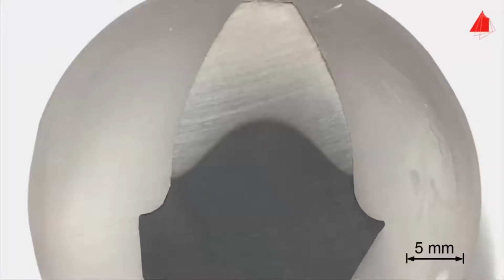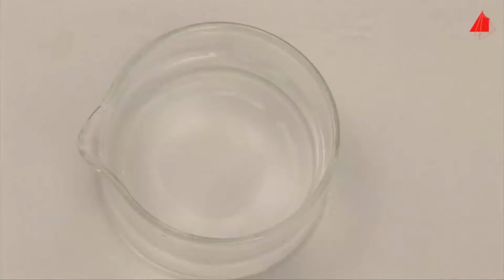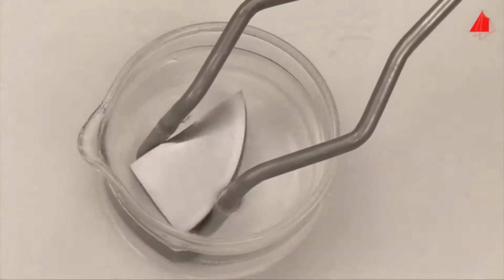In this case, the individual grains cannot be seen. They are far too small. But what may be seen very well is the hardened zone, which appears light, and the central soft and tough region, which appears dark. Next in line is the section of an induction-hardened cylindrical shaft.